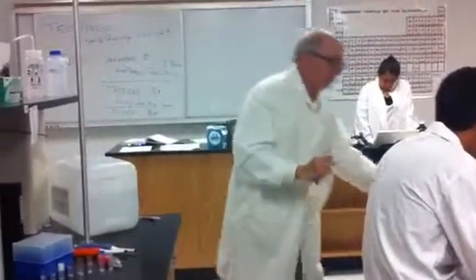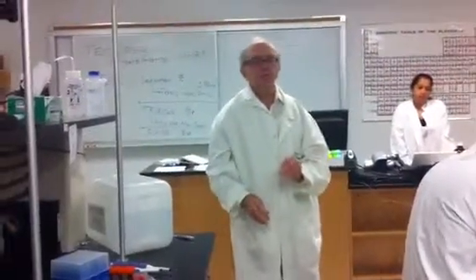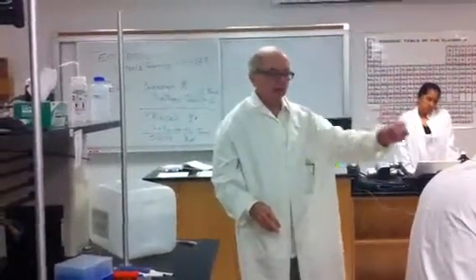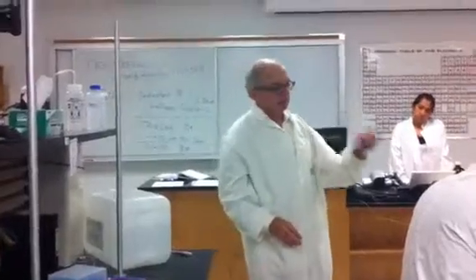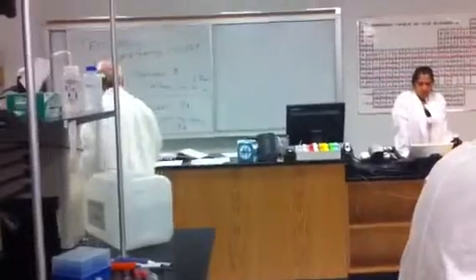I seal it. Mix 1, 2, 3, and put it in less than 5 seconds. Don't say 30 seconds. Don't say 20 seconds. Don't say and then go in. No. It's got to be fast and deliberate. And then you can catch those early time points. Now, let's talk about some of these early time points.